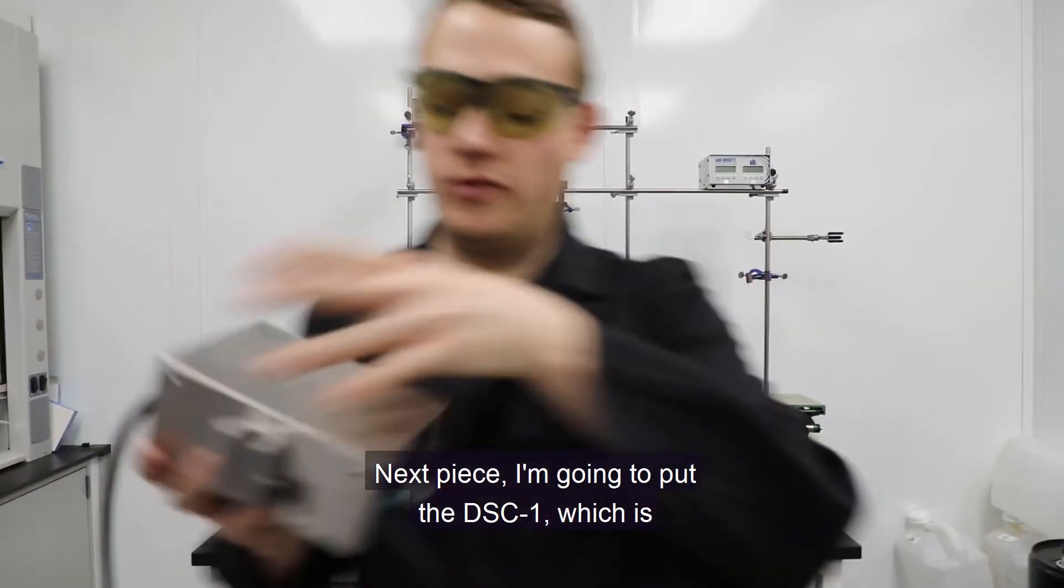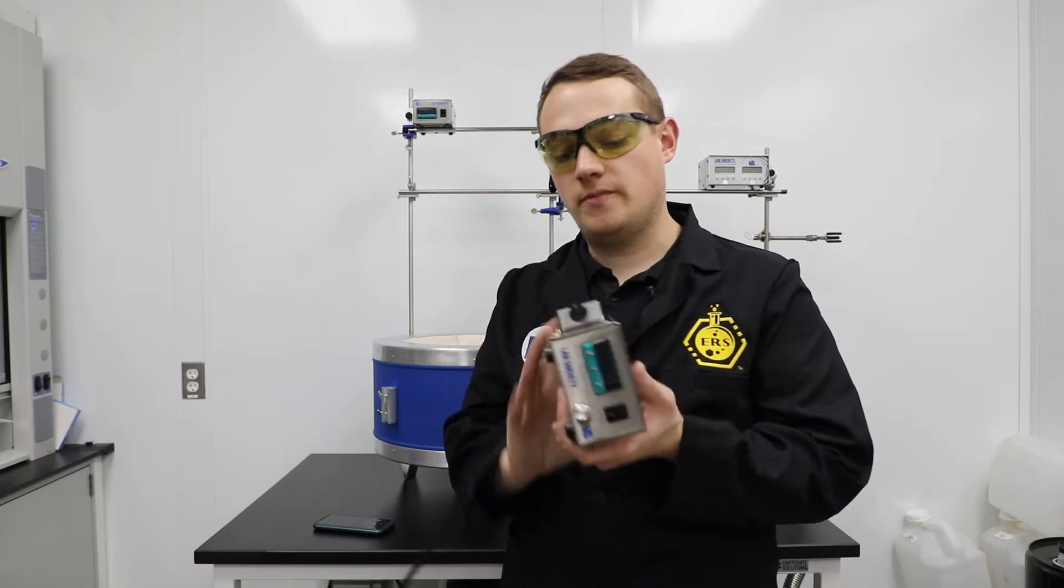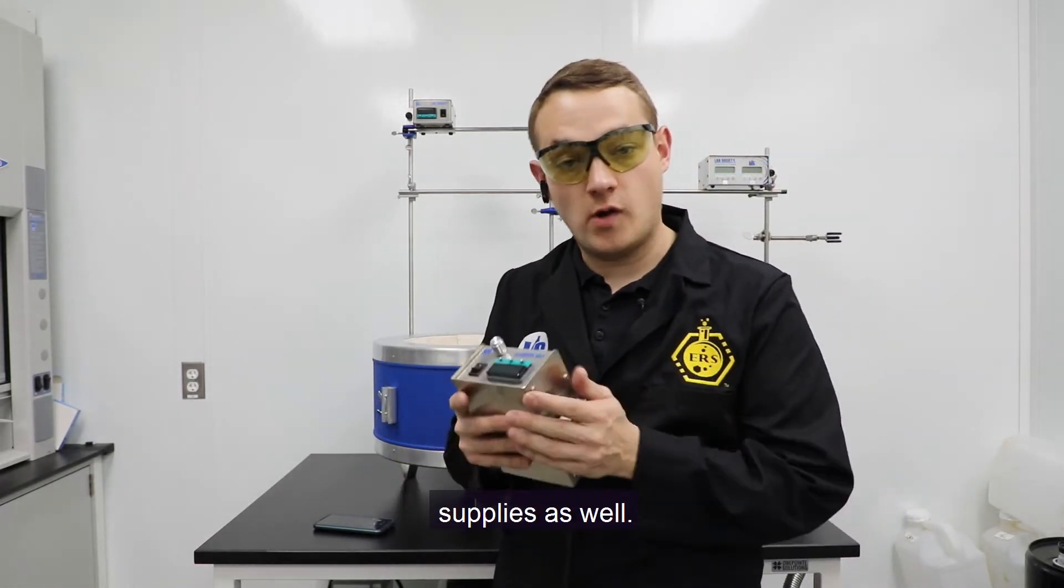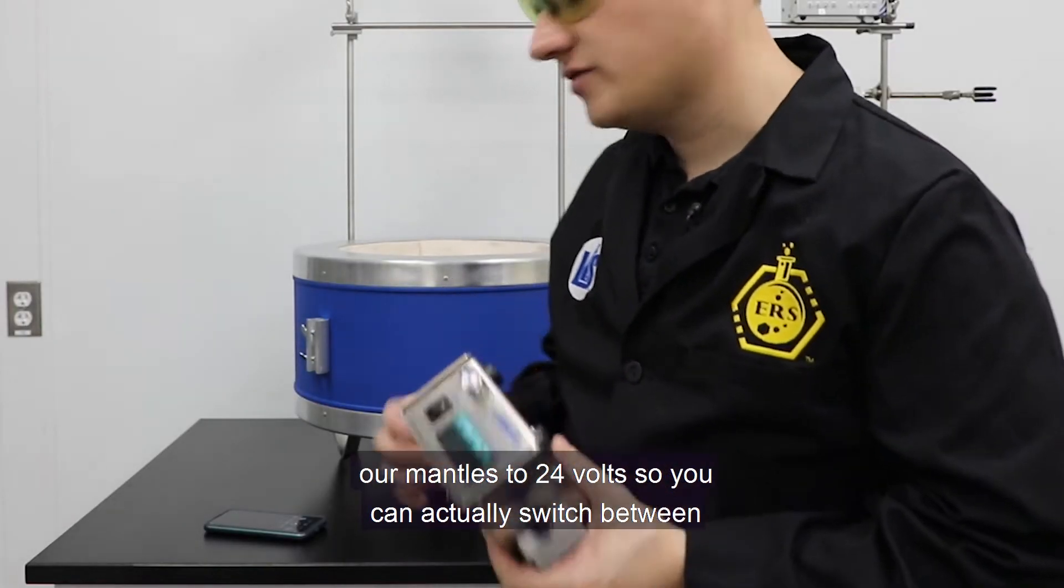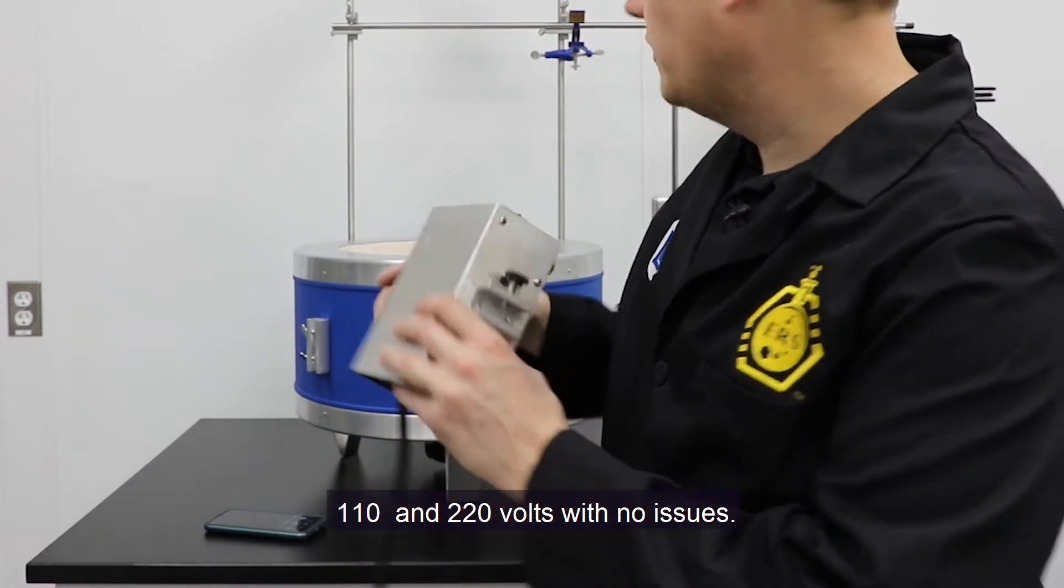Next piece, I'm going to put the DSC-1, which is our digital stir controller. We recently switched these over to external power supplies as well, also for UL compliance, and switched all of our motors on our mantles to 24 volts, so you can actually switch between 110 and 220 volts with no issues.